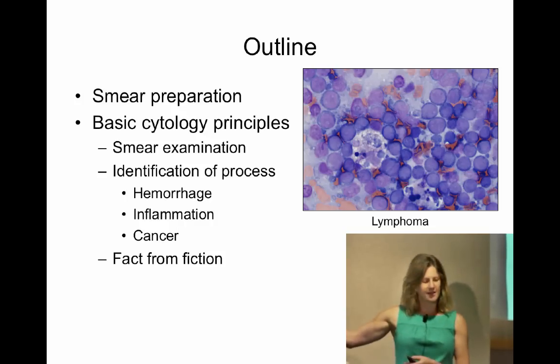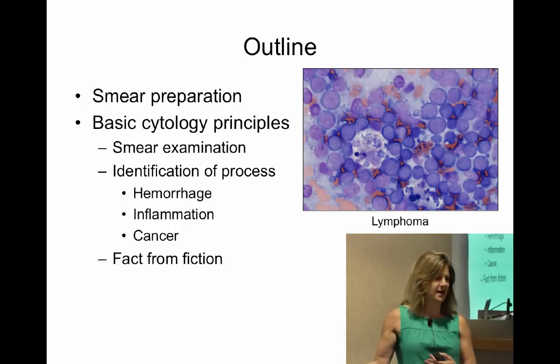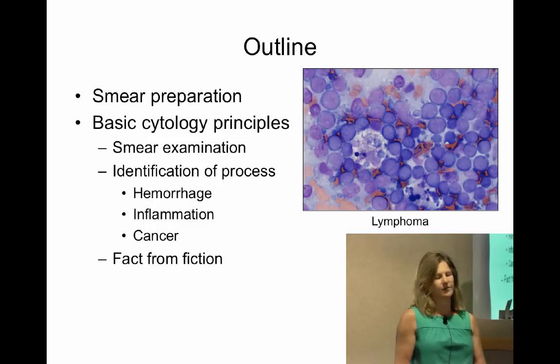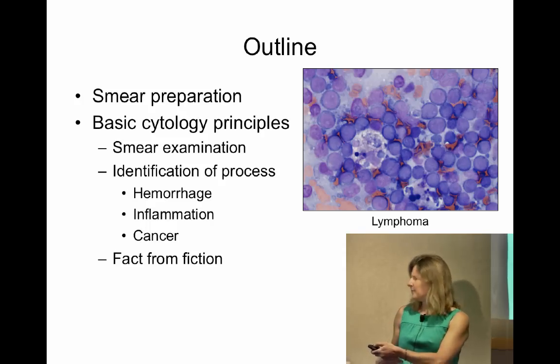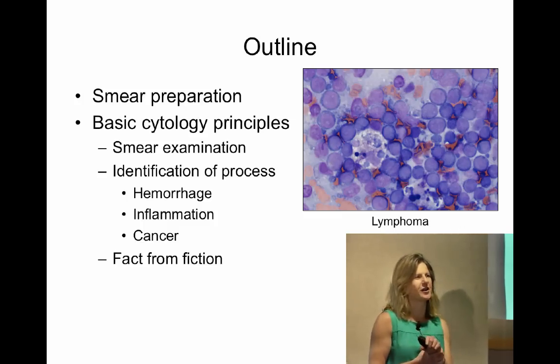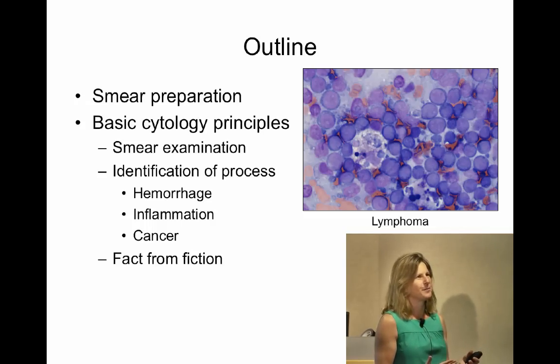But essentially, our interpretation can only be as good as what we're looking at. So if the slide is a poor quality slide, we really struggle with those. So what I'm going to work through now is just how to make a good slide and the things that we've learned about making good smears. And again, I'm also going to talk quickly about the processes that we identify. And for the students that we teach, they always struggle with what do we mean by disease process? Because ClinPath is all about pattern recognition and disease processes.